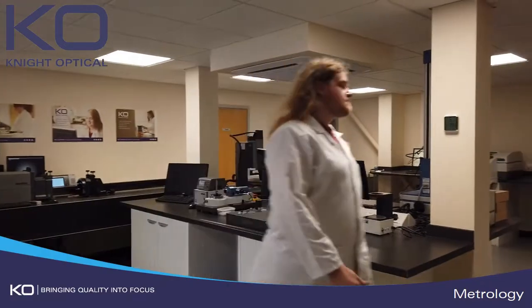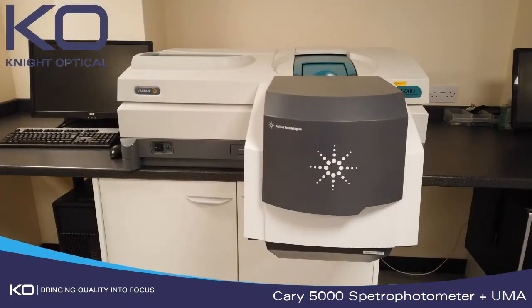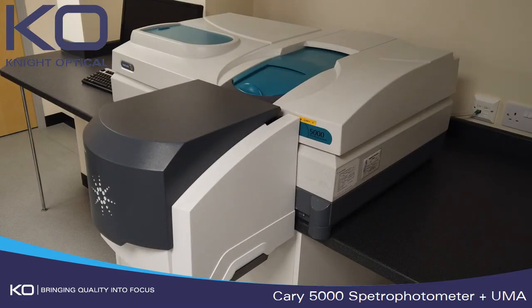Hello, welcome to the Metrology Lab here at Knight Optical. I'm Martin and in this video I'm going to tell you about our Kerry 5000 spectrophotometer with UMA attachment.